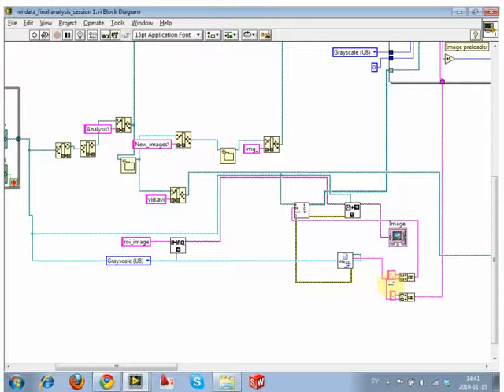Because as we've seen from the other sessions, if you forget to put the star, or if you have the dot in the wrong place, all of the previous sessions have shown that on multiple occasions, explicitly writing the filter gives, I'd say, 25% of the people a problem. But if you had a simple up-down number for choosing channel number, it's way simpler. You're much less likely to create errors. You'll get errors at this point because you'll have things wired together wrong. But as soon as it's wired together right, you won't ever have that same kind of filtering error.